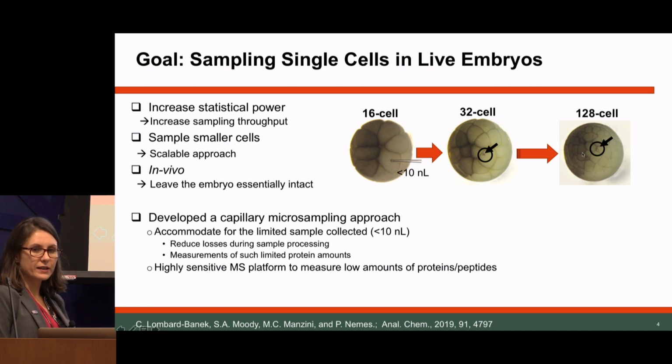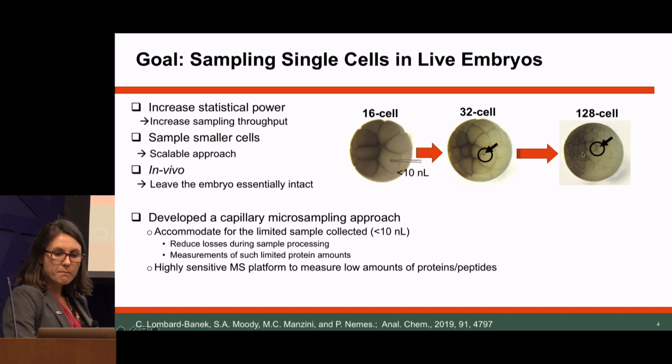However, now we are looking at, as Dr. Slavov mentioned, a sub-portion of that cell. So we had to accommodate and revise our analytical method in order to handle that very small amount of sample that we are dealing with. And so this is our overall workflow.